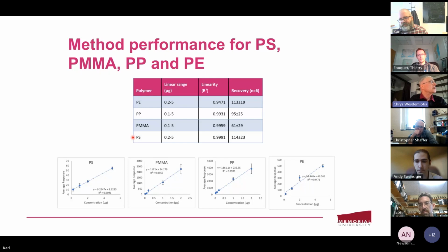I would recommend that you take a 1-to-1 mixture of polystyrene and polyethylene, either molar or weight to weight, and try that as a calibrant. You may be surprised if you only see polystyrene, or that will give you some explanation of all those questions that we raised now. It's very interesting, very exciting, as previously said, and this type of experiment will probably shed more light on that if you analyze the mixture.